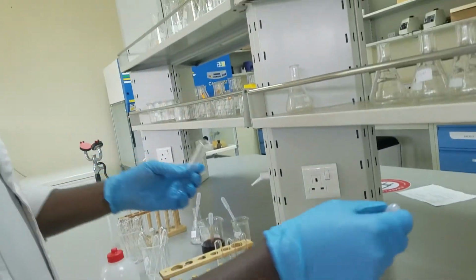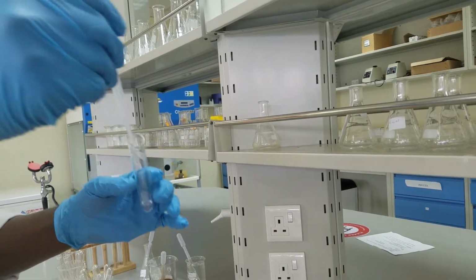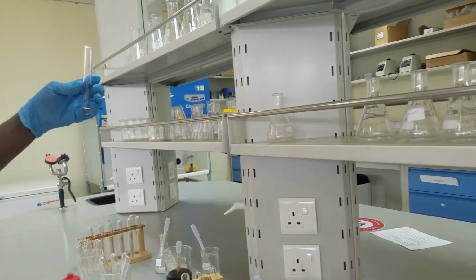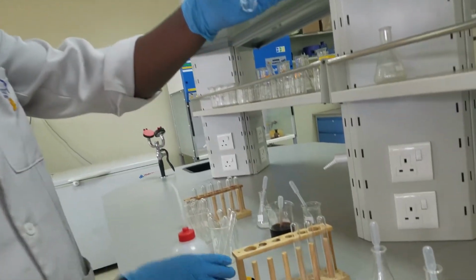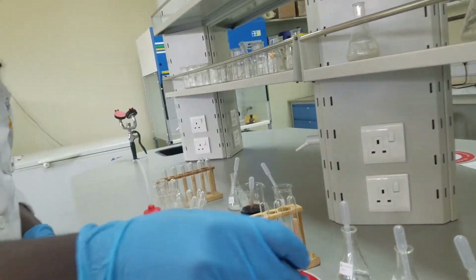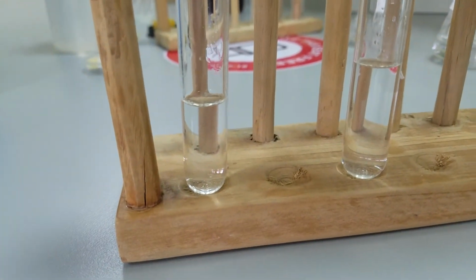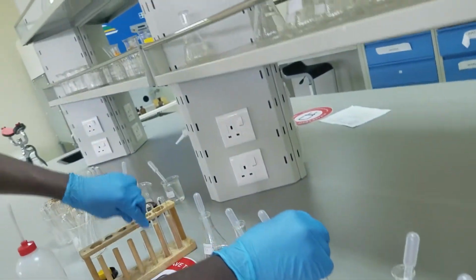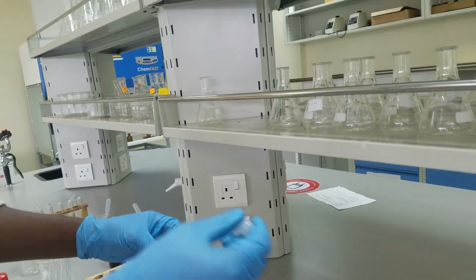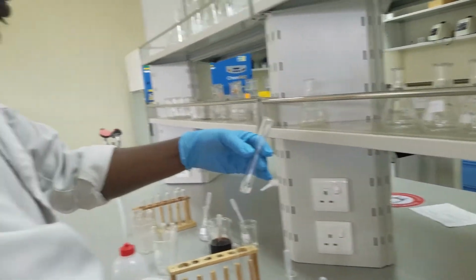Our third one is acetic acid, like that. Then view. Okay, and then our last known is ethyl acetate.